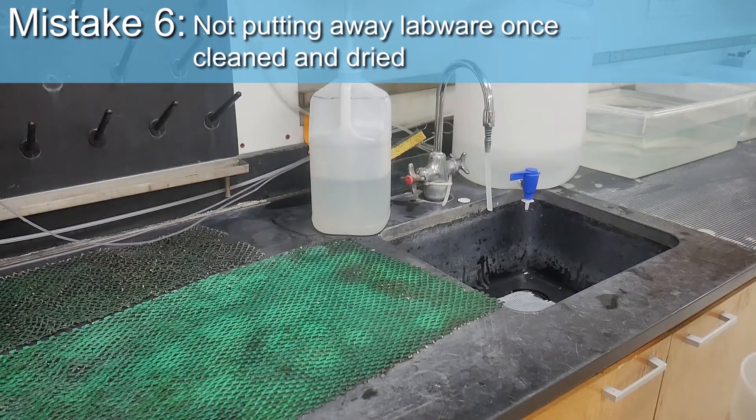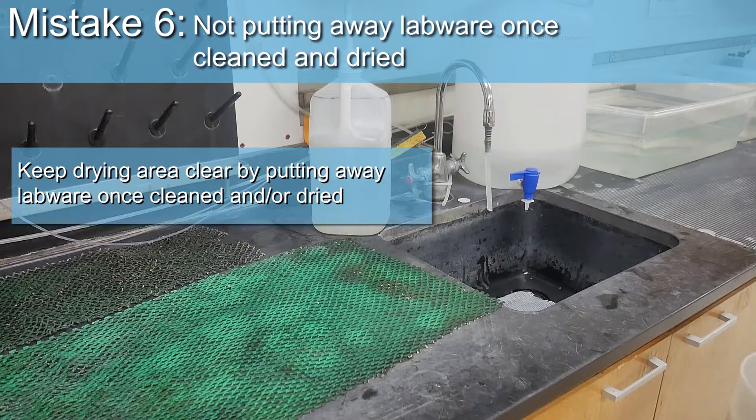Mistake 6: not putting away labware once cleaned and dried. Thank you.